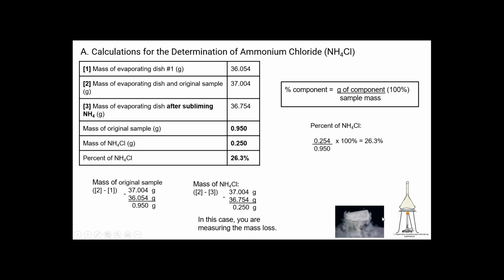Okay, and this here is not ammonium chloride, but this is a good example of what happens when a substance goes from a solid to a gas and not into the liquid phase.